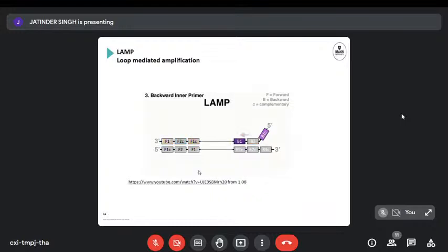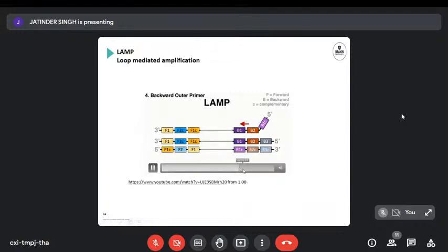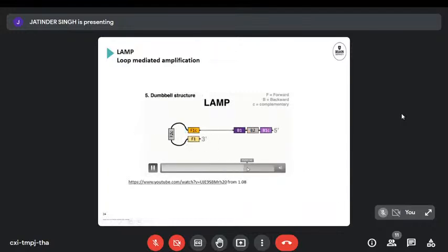And it doesn't work as well without the narration in there. So we get the different primers to bind to then form. There we go. So they then need to fall together for the actual amplification to start taking place.